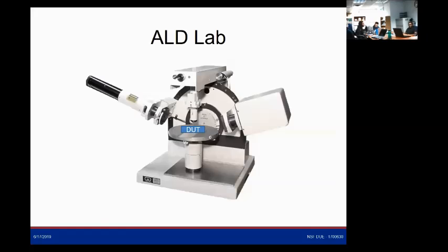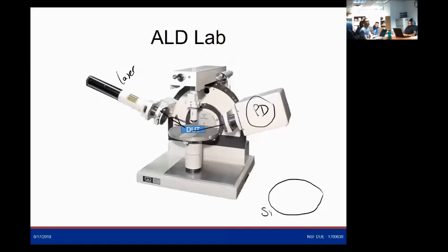So we will do the following. We will start with a silicon wafer, okay? And as I was saying, this is an ellipsometer, and maybe you guys already did a measurement with it in your lab too. This is a laser here. We're sending the light from the left, and this is our photodetector, PD. The material reflects back the light, and then you try to extract the information from the photodetector. So you try to extract what information? The thickness. So we will just get an ordinary silicon wafer.